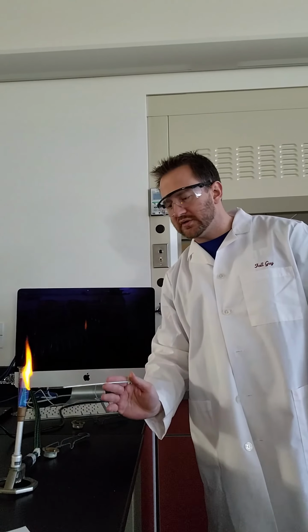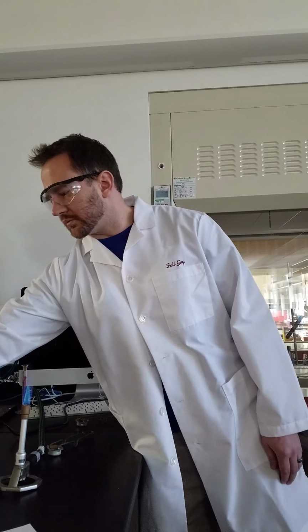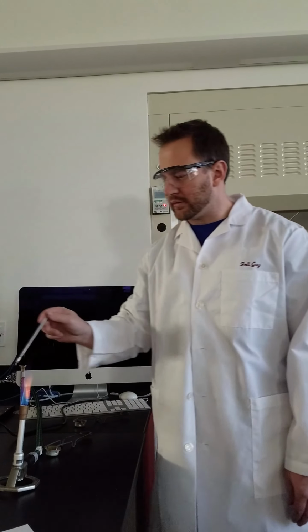Now, lastly, we're going to look at sodium chloride, which has obviously a different anion because it's not sodium nitrate. And you can compare the color of each of these to see how little the anion actually affects it. And now, lastly, I'm going to show you sodium chloride as a solid, which clearly gives you the same color.